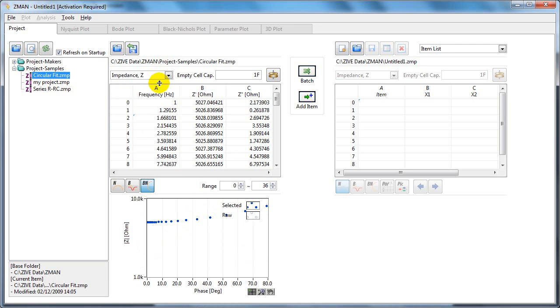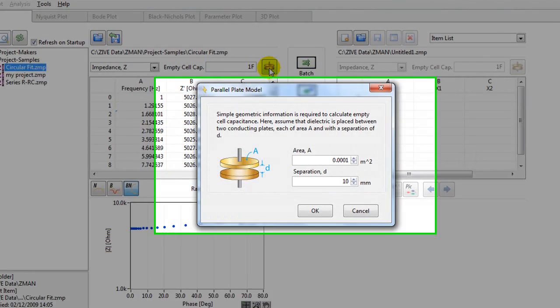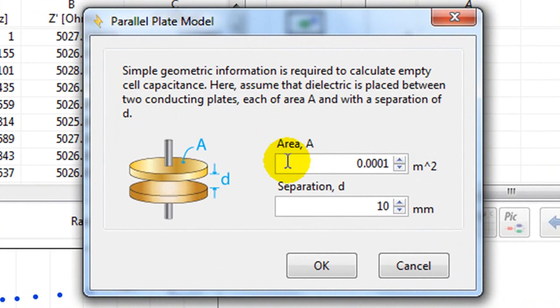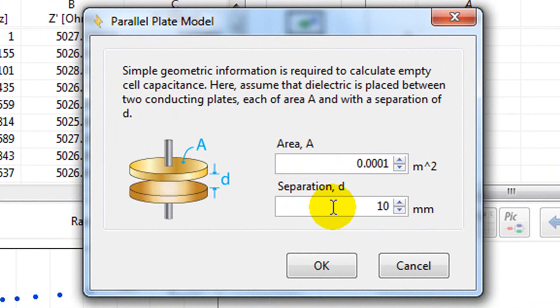To get the dielectric constant and the modulus, you should input the cell capacitance value here. If you don't know it, click on this button to set the geometry. Enter the values here. The area is the electrode area, and the separation is the distance between the two electrodes.